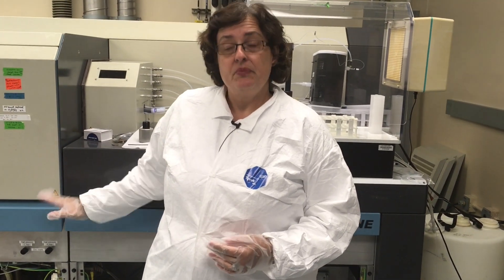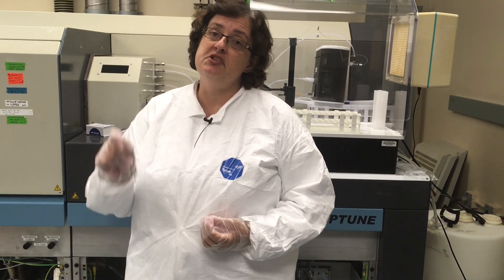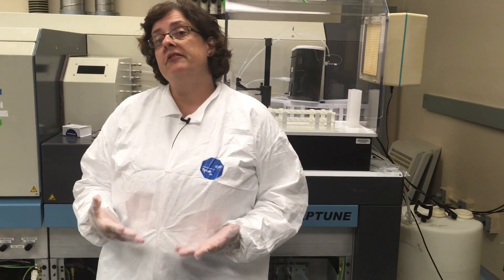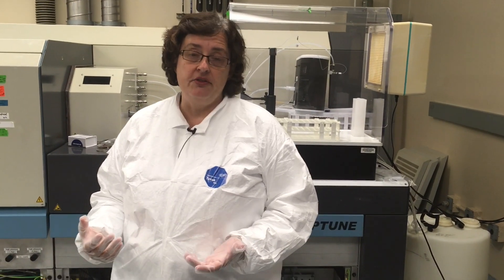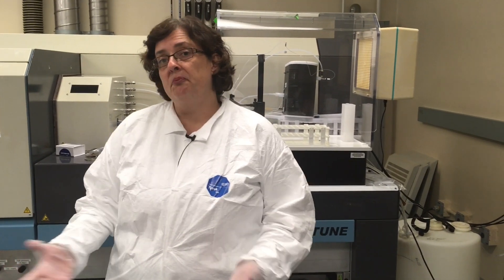Before a sample comes here, we have to do a lot of sample preparation to get it ready, because we need to purify out just that element of interest. We have validated methods in different sample types to do that, but depending on the project it may also require method validation.